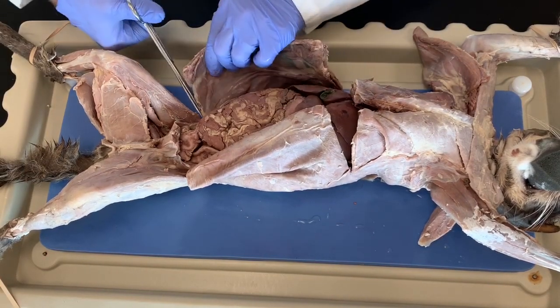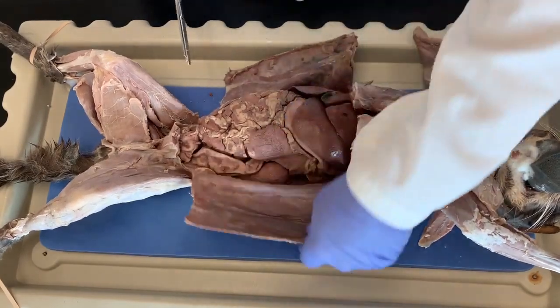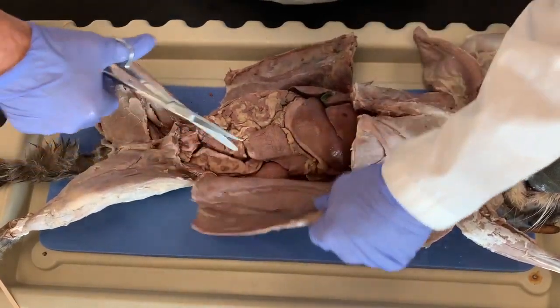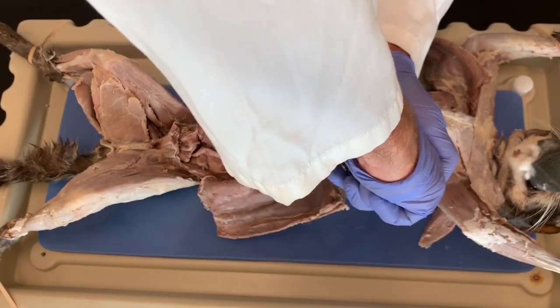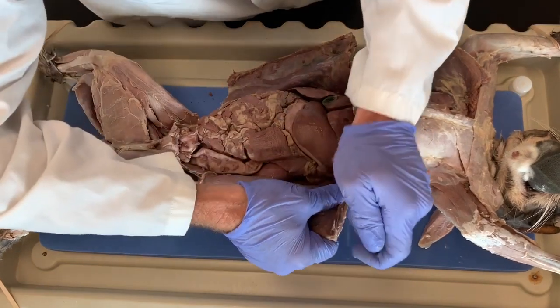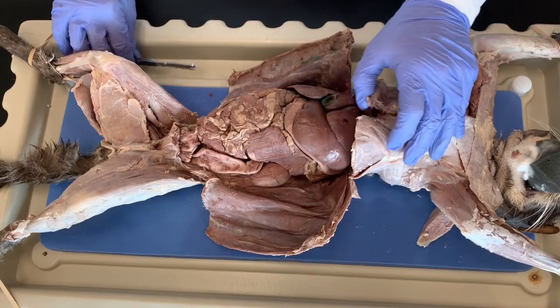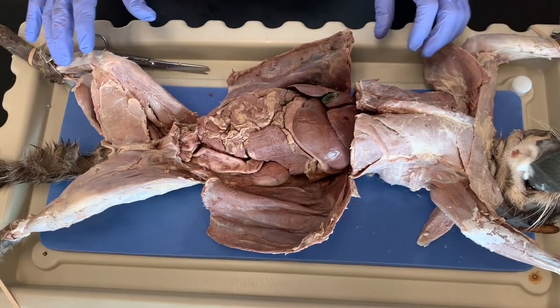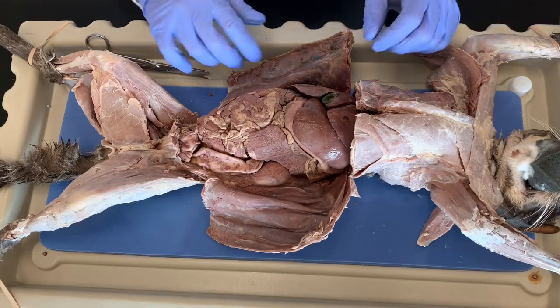So go right below the diaphragm, through the ribs, do a lateral cut all the way down. And then what we do is, now we have space to fold the abdominal muscle laterally so we can see more of the features. There we go, let's break it that way. All right, so this gives you initial exposure of the abdominal cavity.